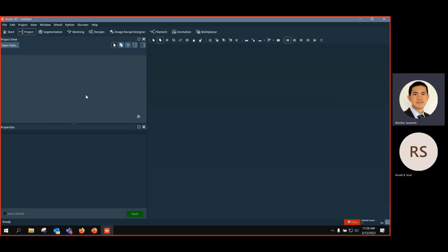Each module has different details. For example, we have green color coding for data. And if you have yellow or orange, that means visualization module. And then when you do computing, we can activate red or blue or purple modules that are more computing modules. You can see later in the training. And on the right here, we have 3D viewer, so we can do visualization of the 3D.